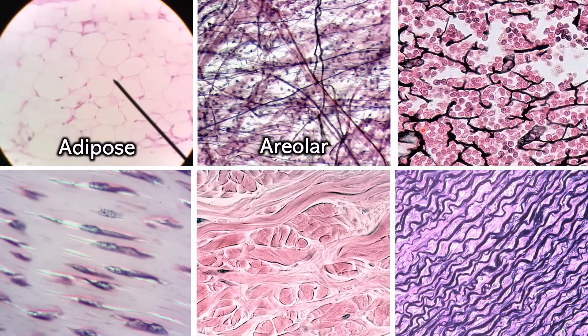If you compare these black thready fibers to the fibers you're seeing in the areolar, you'll notice that they look more like a net and more like a mesh, whereas the areolar ones are very straight. Those are the reticular fibers — so this is reticular connective tissue, and this is the one where you need a special stain to see it. When you're first learning, usually the example they show you is a lymph node, and in a lymph node you have lots of circular cells, which are also a hint that this is reticular.